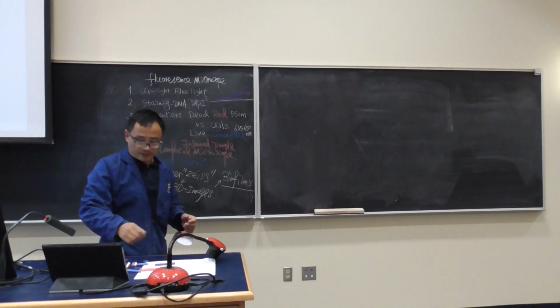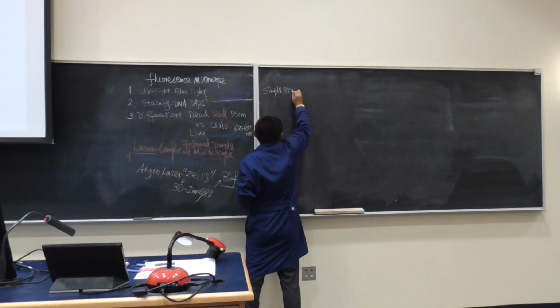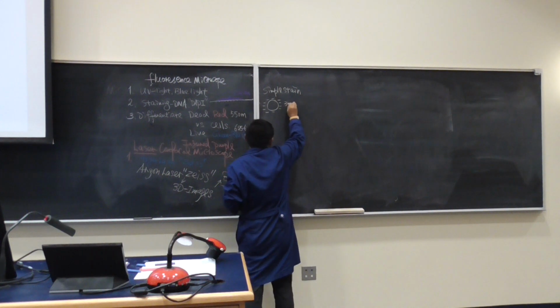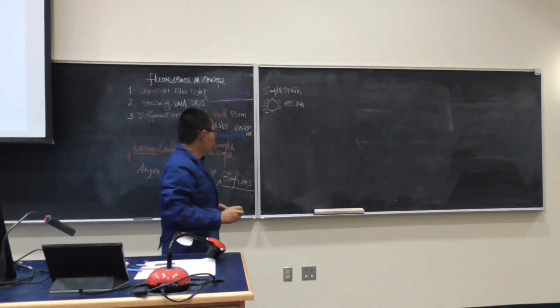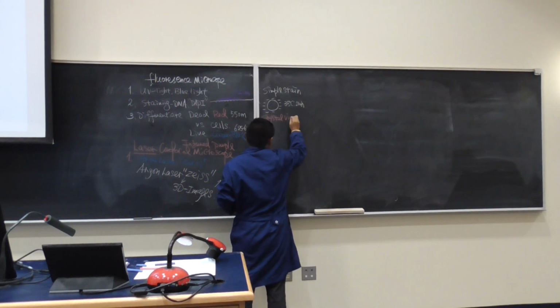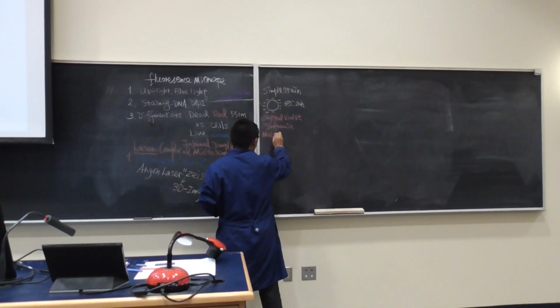And we just barely mention here, to tell you the simple stain, the story behind it. Simple stain works because the bacteria are negatively charged, if they grow at 35 degrees Celsius for 24 hours. And you have lots of dyes, like crystal violet, safranin, and let's say malachite green.